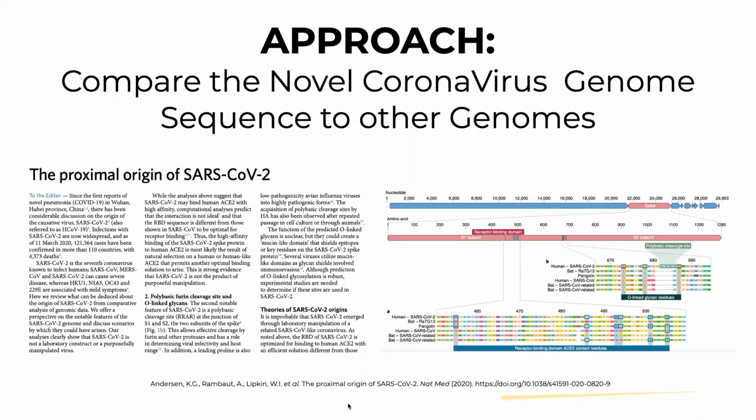So here's a publication that was recently published in Nature Medicine, where they took several different sequences. Those sequences included human SARS-CoV-2, the sequence that we just looked at, and a couple of sequences from bats. You can see bat, 3 of them right here. Another human SARS, so not the novel SARS, but the older one from 2003 to 2007, and a sequence from pangolin. And then by comparing these different sequences, they found specific changes.